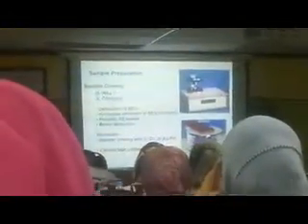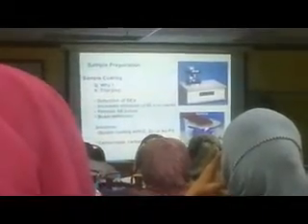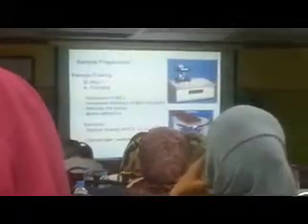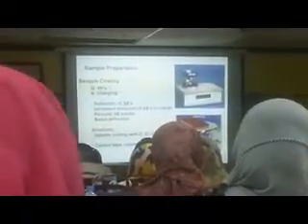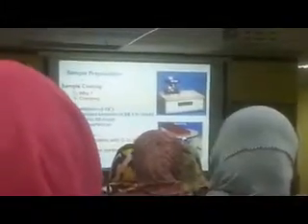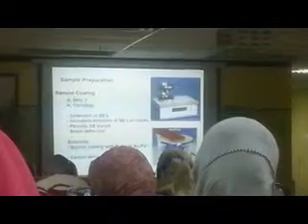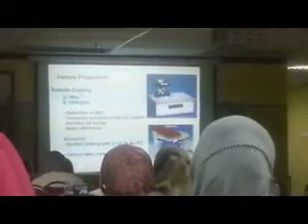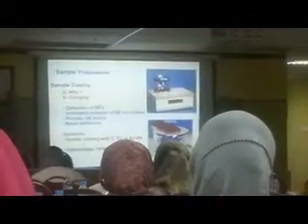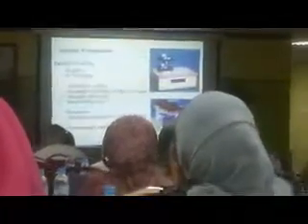Sample preparation: most of the time metallic samples are quite easy. Just polish it, metallographic polishing, sometimes you may need etching. So you polish and etch and just go to the SEM lab. But if you have a non-conducting sample, then you have a problem of charging, so they may have to coat a bit of a metal layer on the sample, which sometimes alters your sample properties, sometimes it may not. So you have to keep that in mind before doing SEM of your samples.